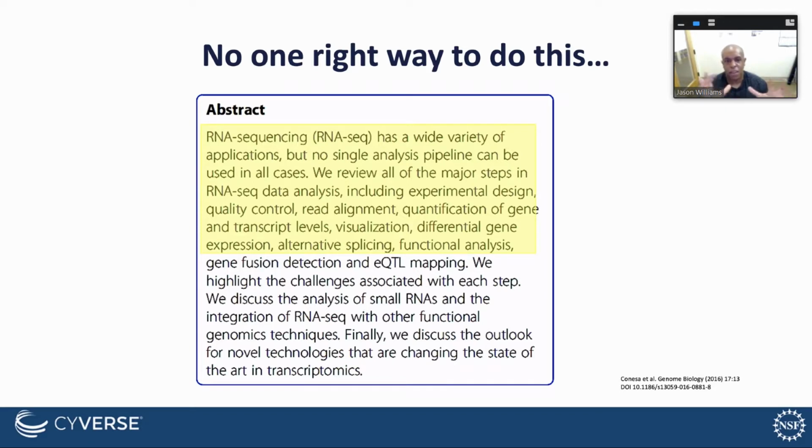Just to say, for example, I like to go back and forth between my slides and this for emphasis. So even if you come up at the end of your analysis and you have a list of genes, and some of them don't quite make the significance cutoff, a collaborator or somebody else might just throw them away and not consider them.